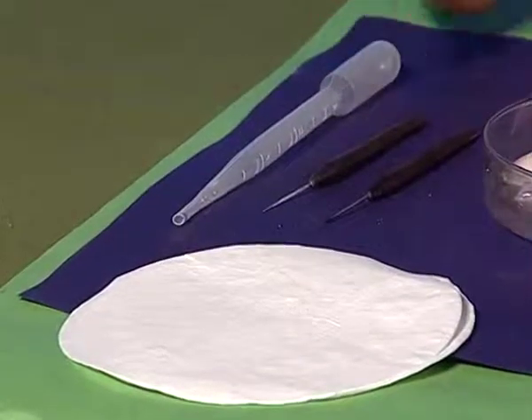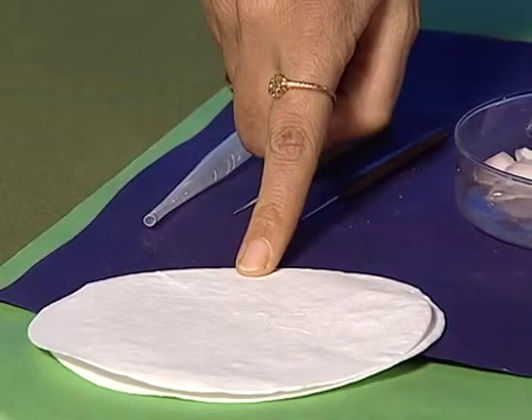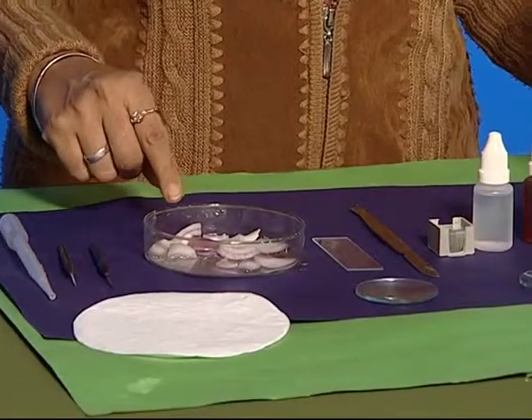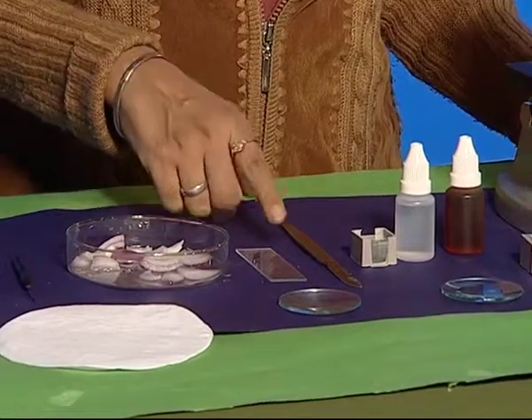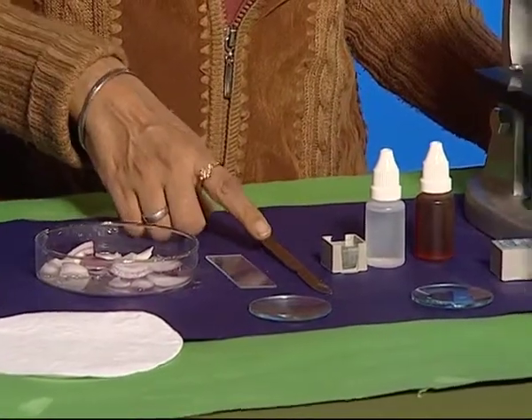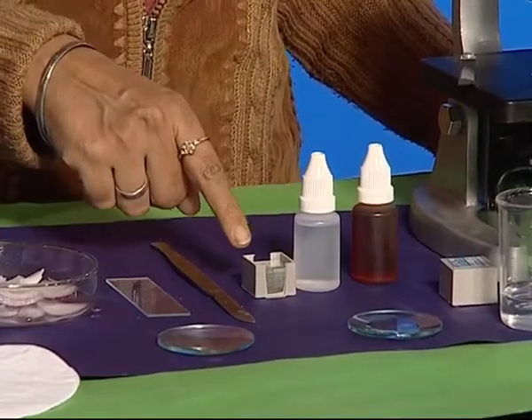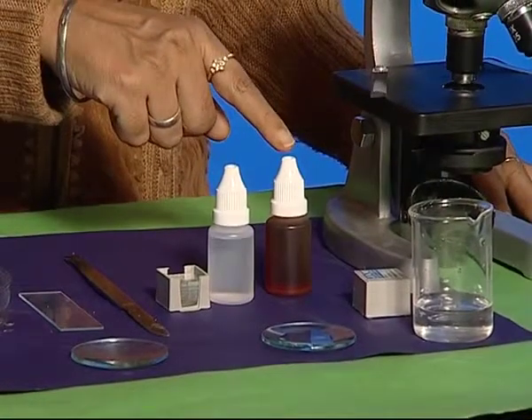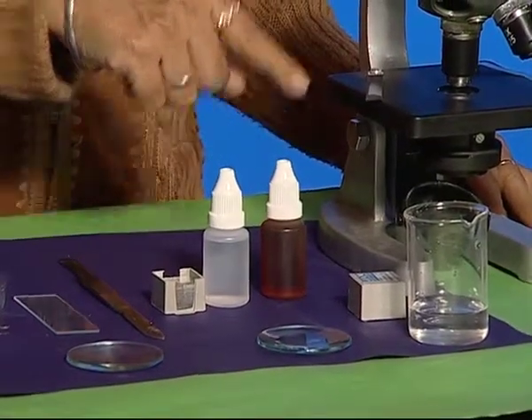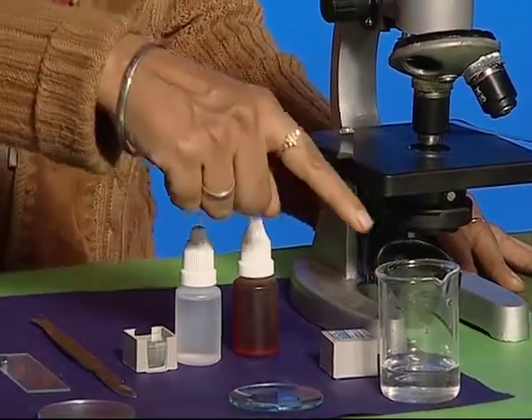First, we take a dropper, needle, blotting paper or filter paper, onion, glass slide, razor, watch glass, cover slip, glycerin, iodine, compound microscope, and some water.